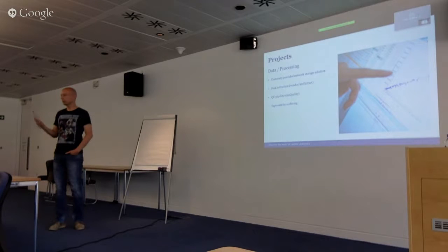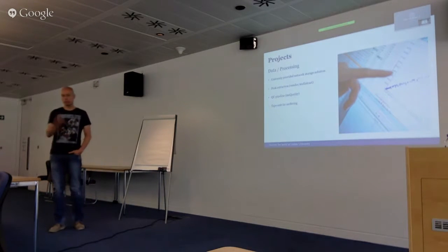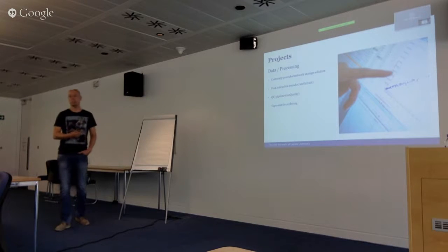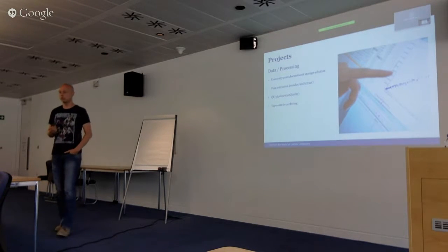By using the quality controls, the system stability tests that we have, with the help of statistical methods and algorithms, we define the quality of the data and try to filter out the useful parts.